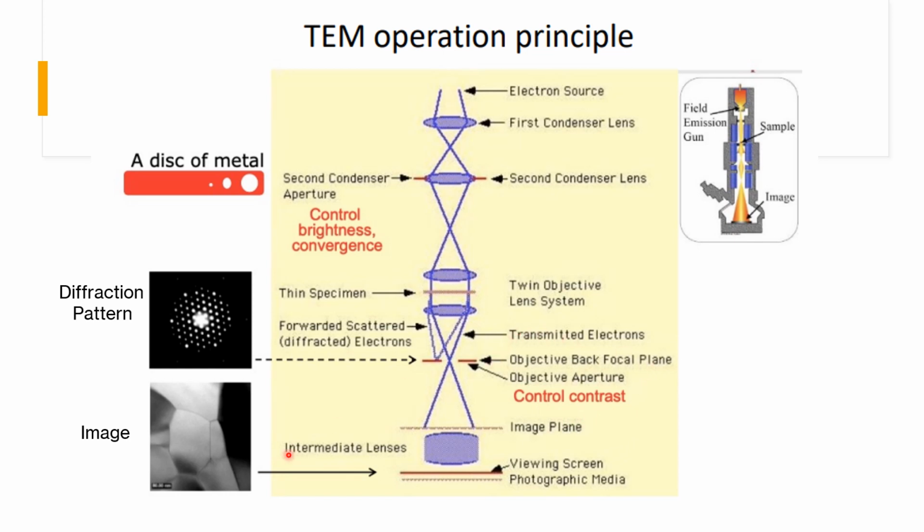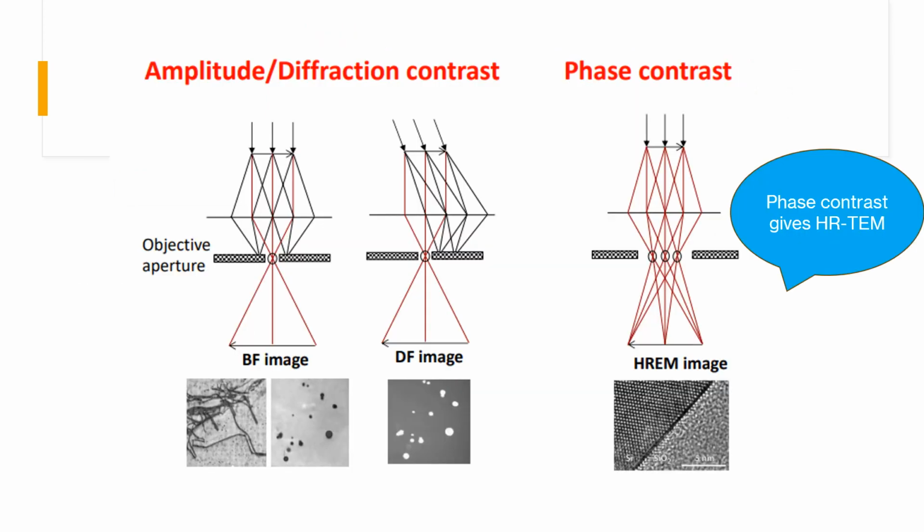In any image, we can see over here how the figures are presented, how the surface boundaries are separated from each other. This is actually decided by the contrast. Contrast can be defined as how one object or one entity is separated from another. This is called the contrast, how one is separated from its neighboring part. So how this contrast is generated, we will be discussing.